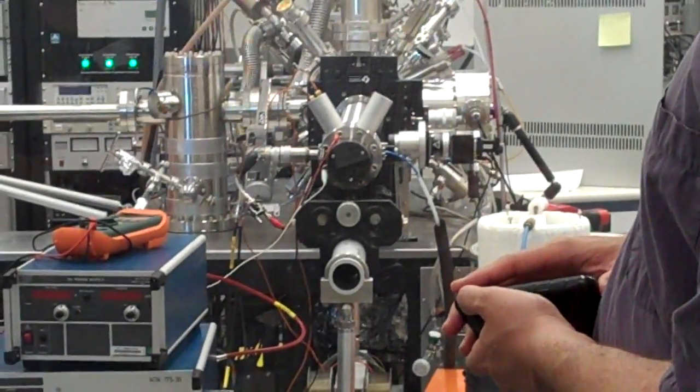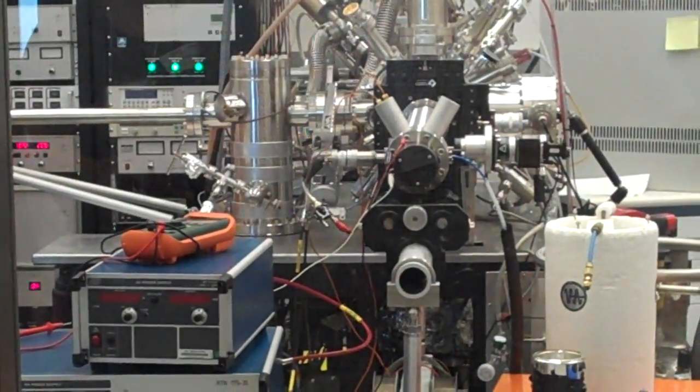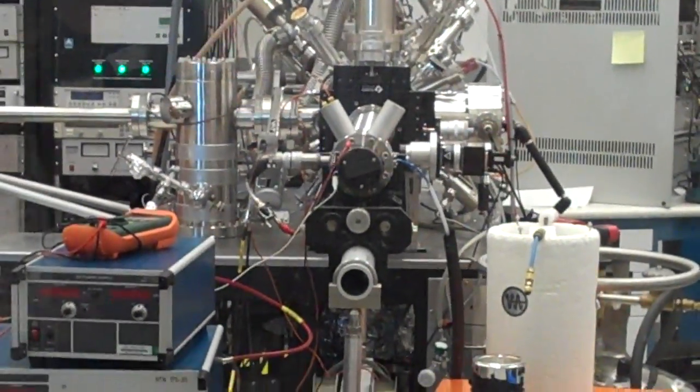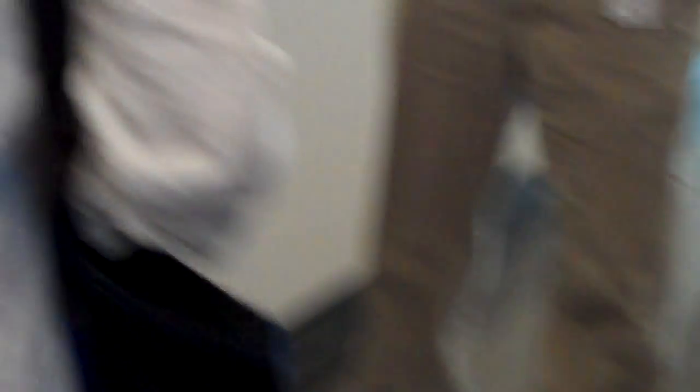They probably can do other tricks too. I don't know off the top of my head. There are several more neat machines down this way you can take a walk by, but I'm afraid I don't have time to describe them all to you. What's the name of machine that you're using? That's a scanning tunneling microscope.